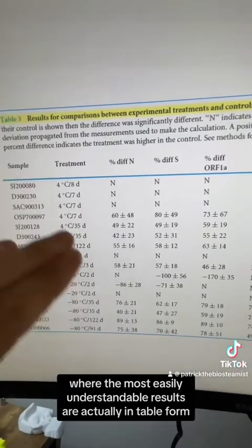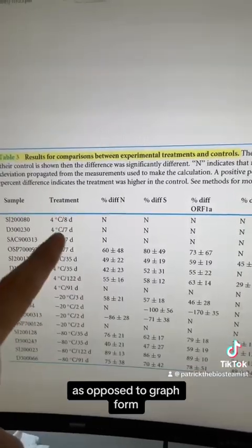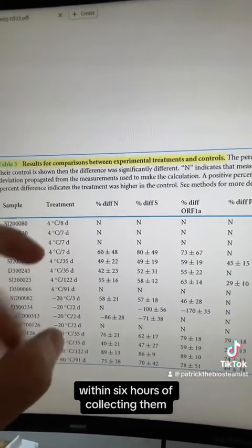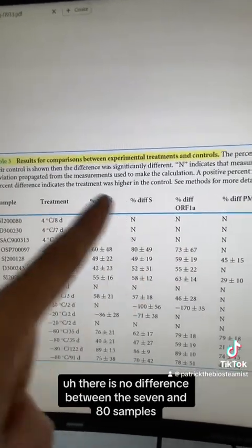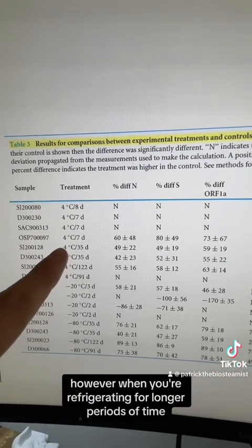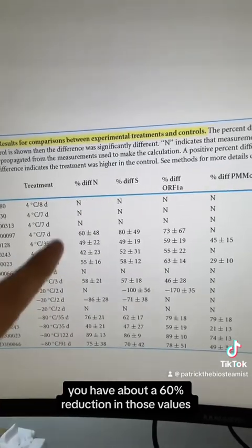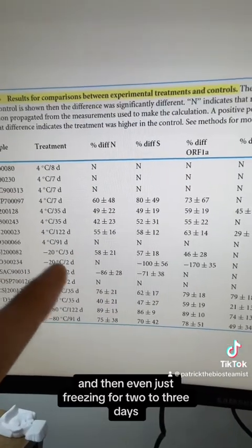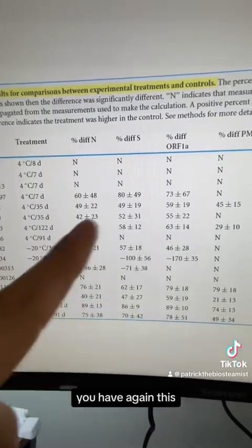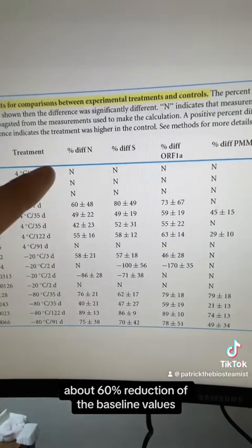where the most easily understandable results are actually in table form as opposed to graph form. Compared to testing samples right away, within 6 hours of collecting them, there's no difference for the 7 to 8 day samples. However, when you're refrigerating for longer periods of time, you have about a 60% reduction in those values. And then even just freezing for 2 to 3 days at negative 20 degrees Celsius, you have again about a 60% reduction of the baseline values.